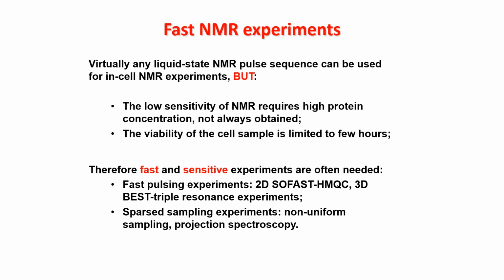And these are most of the time the fast type of experiments, like the SOFAST HMQC, the BEST type 2D and 3D triple resonance experiments. Then there are other methods to shorten the acquisition time that I will not talk about.